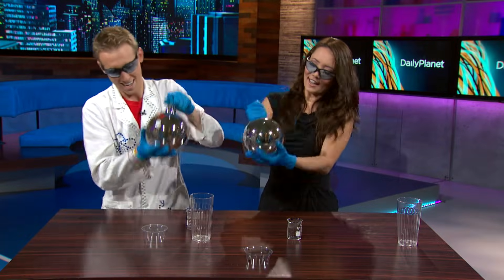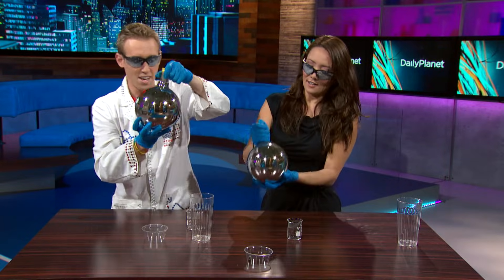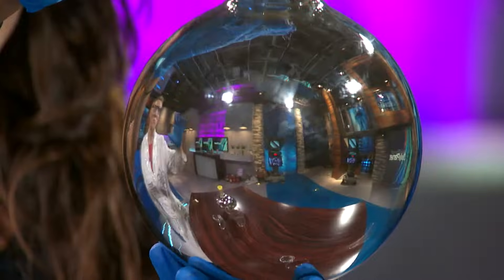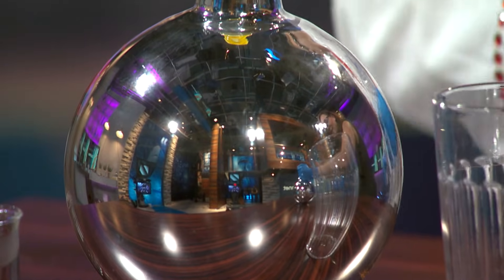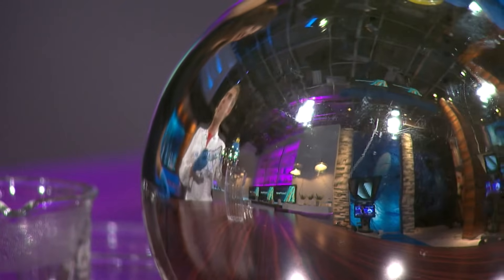We can actually zoom in and say hello to our camera operators — look at that, we can see them in the reflection! This mirror is made of silver using a chemical process. All metals reflect light, but they reflect it slightly differently — for example, gold reflects more yellow light, that's why it's that color, and copper reflects more red light.